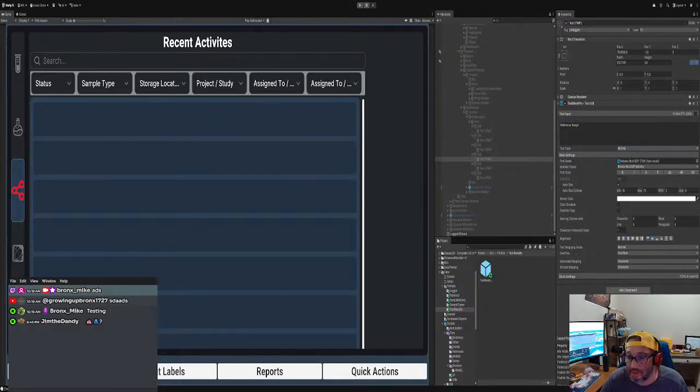That's the best way to do it if you really want to, but that's going to be a little bit of coding, not a lot of coding. I suggest you do it because that's what the customers are gonna want, and that's the most dynamic. But just remember, you're probably gonna get some bugs, and you gotta work it out. So test it way before you ship it out.